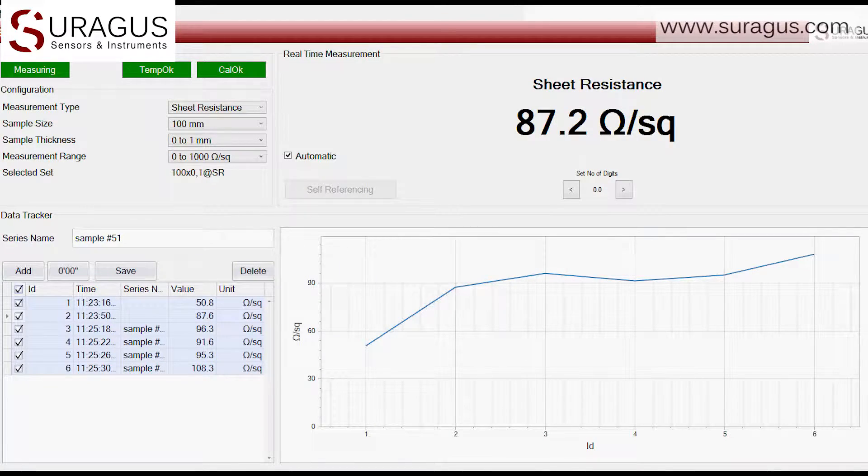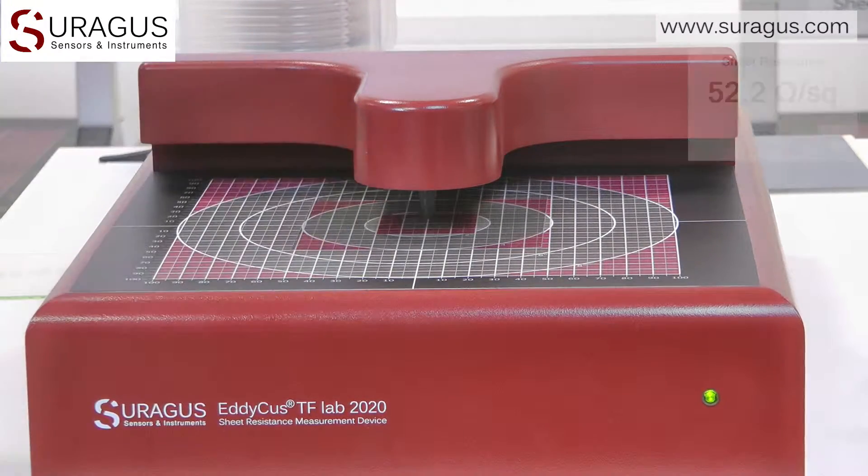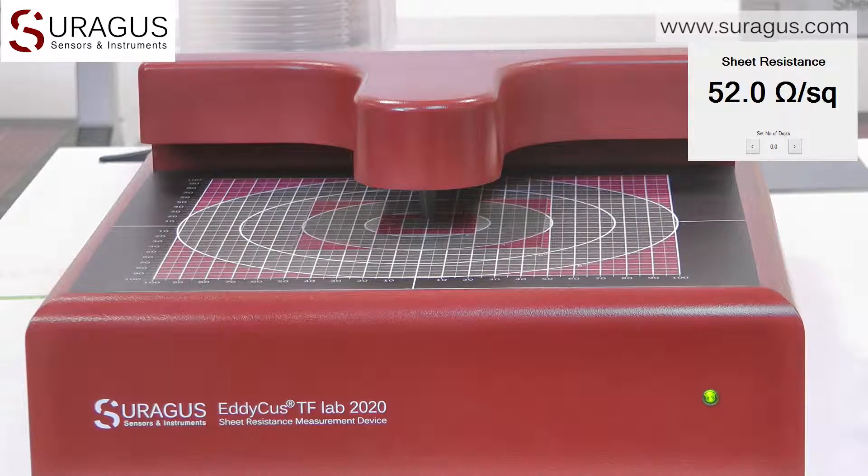The software menu is very clear, easy to use and can be well operated via mouse or touchscreen. For example, let us measure the sheet resistance of an ITO layer or any display electrode material on glass or foil.